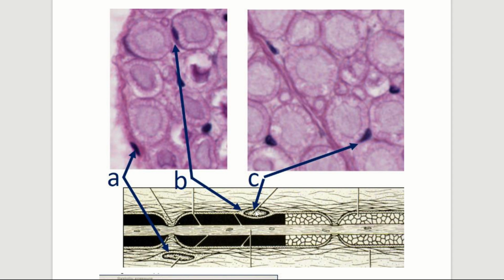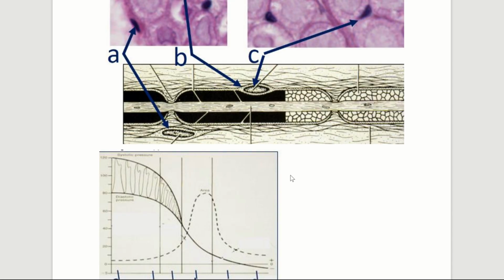And then C, so this is pointing to the same thing right here. So hopefully this is also a Schwann cell, and it is. So you see how this is kind of connected to the myelin around this axon. It's kind of making like a little hat on the axon. It's sitting right on top of it, different than this one, right? So this is also a Schwann cell. Okay.